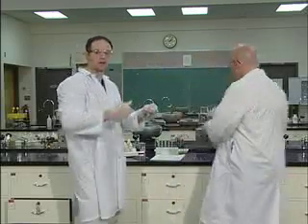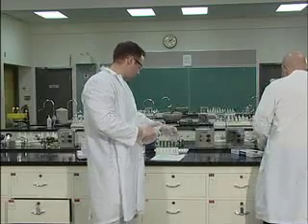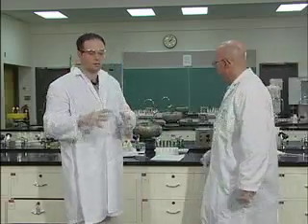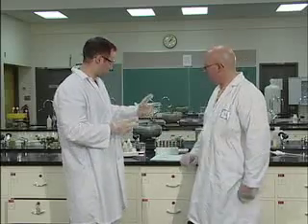Normally where there's a temperature change, there's a reaction, or in fact all the time when there's a temperature change in this reaction. So again, you're going to do basically those same steps for C1, C2, C3, C4, all the way through, noting observations for each one and temperature changes for each one. That was just an example. I just chose the aluminum because it had the, I got to say flocculant again.